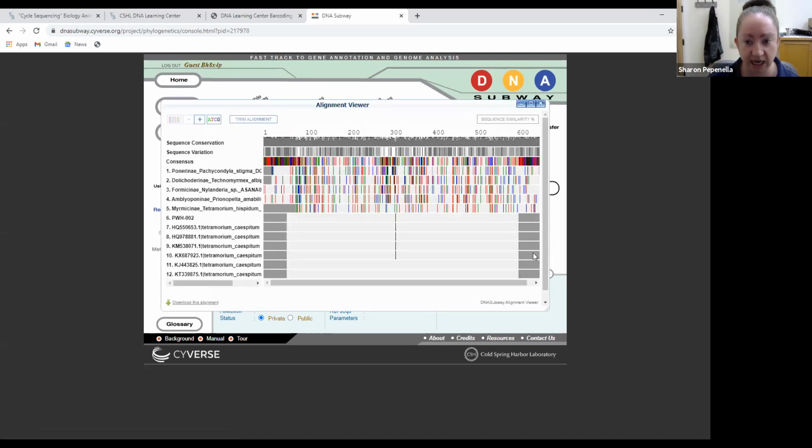And what you see now is, ta-da, our sequence alignment. So what is this? Well, first of all, this kind of looks like one of those UPC codes, right? Like a barcode. So this is in part where DNA barcoding gets its name. What we're seeing is a pictorial representation of the differences in our DNA sequences. Anywhere you see a colored bar here, red, green, blue, or black, that's representative of an A, T, C, or G at that position that is different than some of the other samples that you see here.